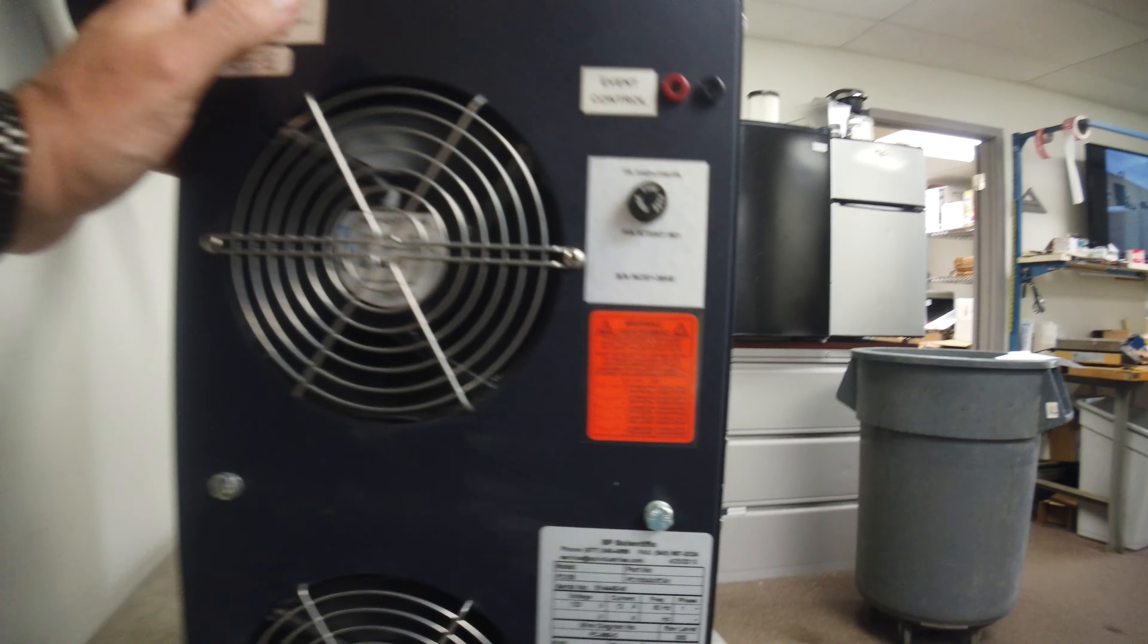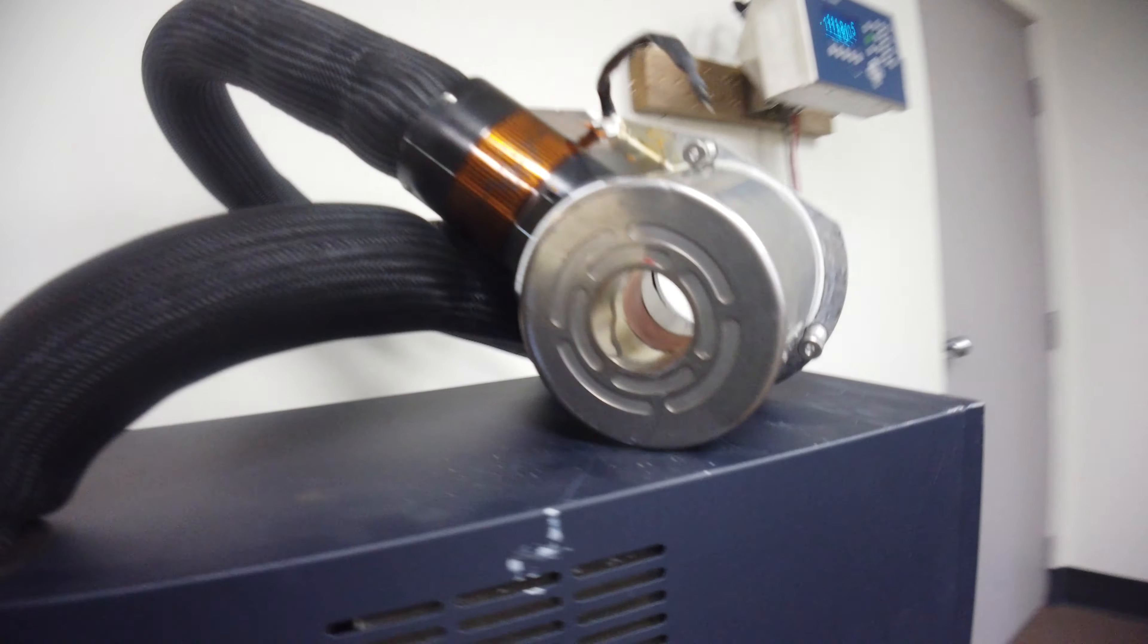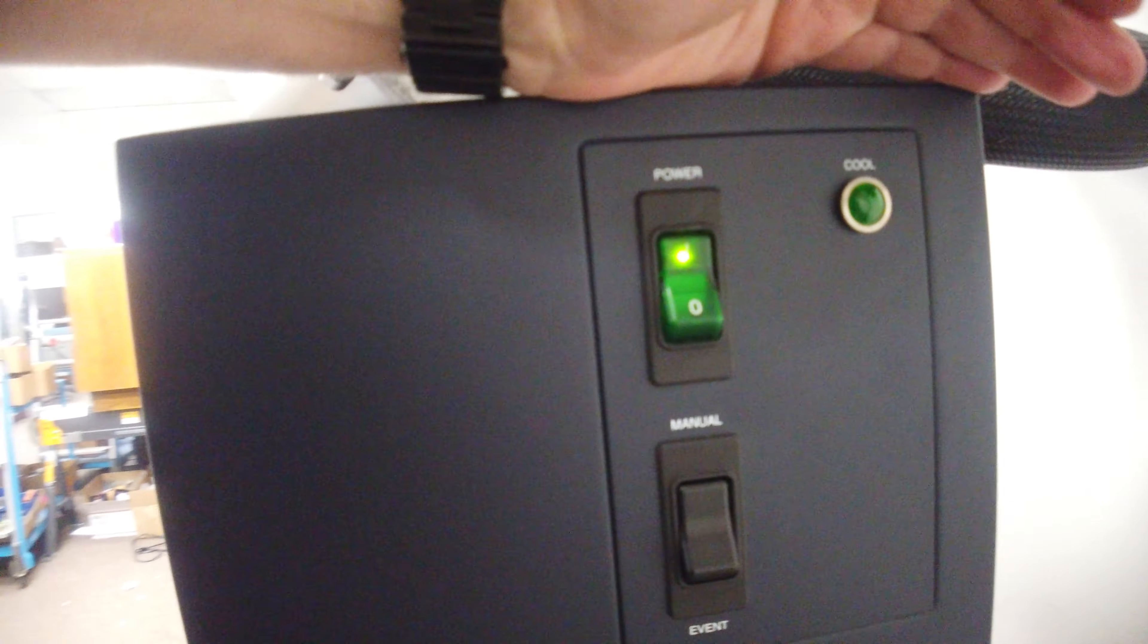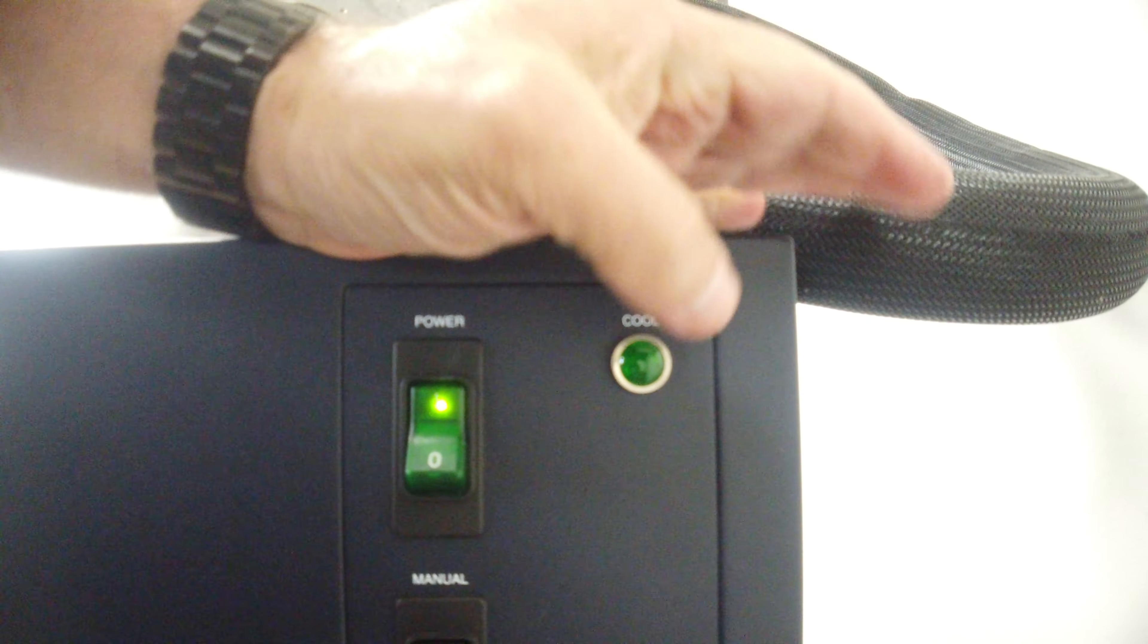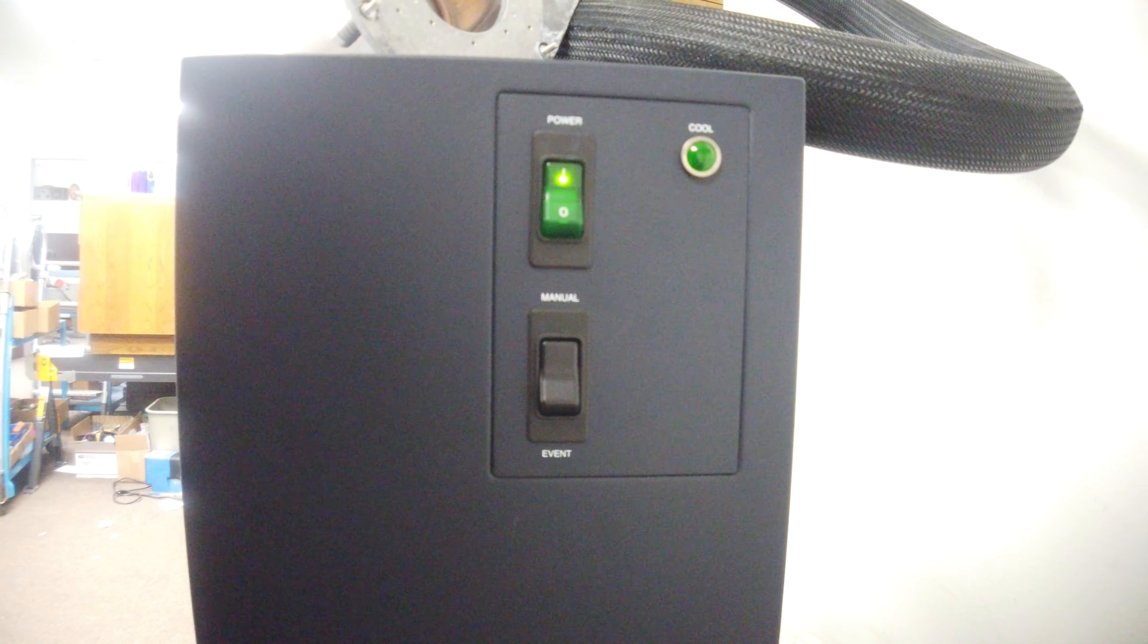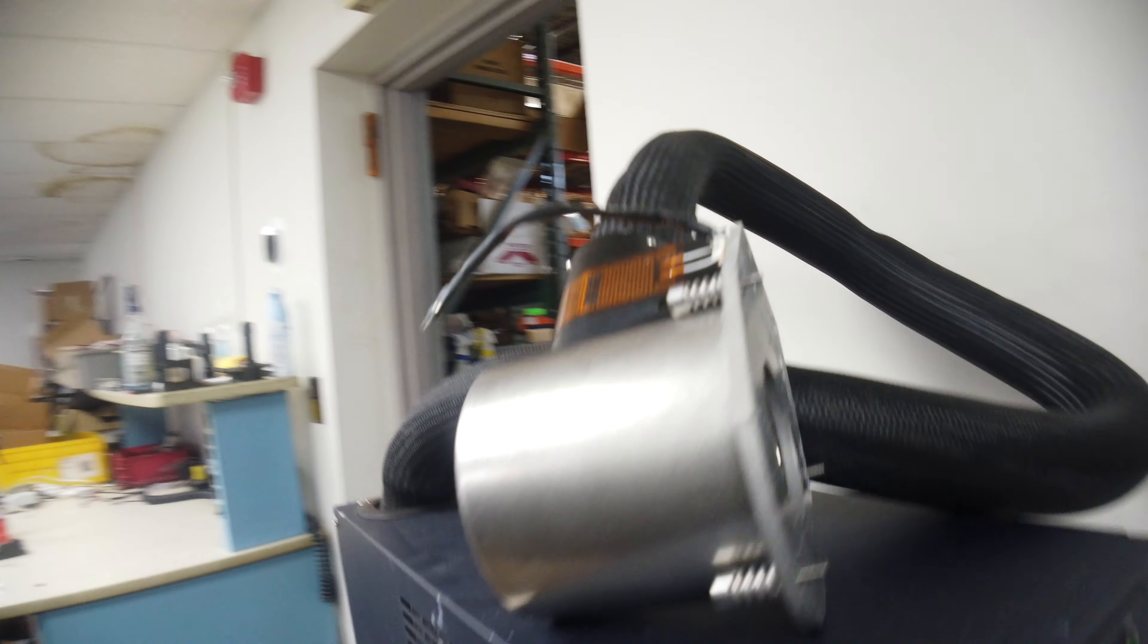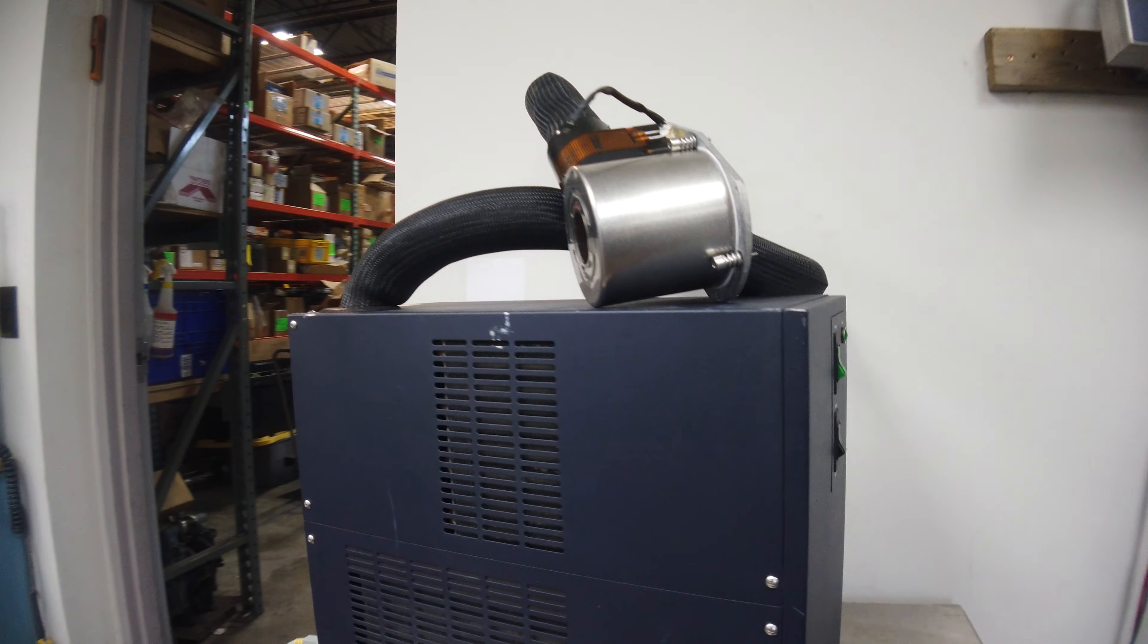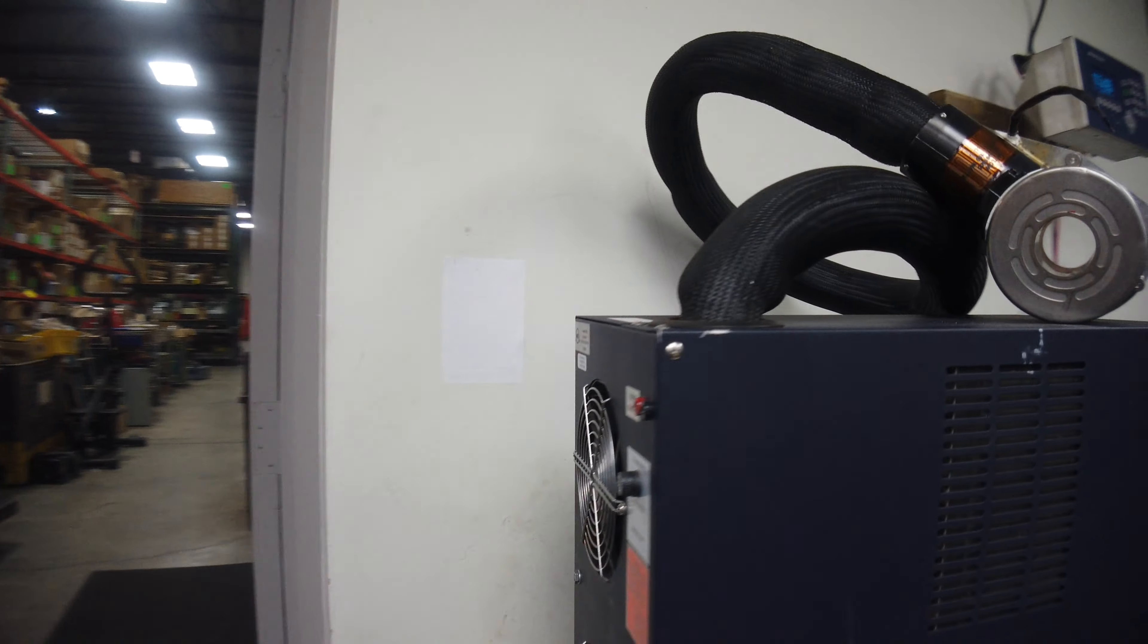Let me show you what else to show you on this. There's not much to this unit. And that's it. It came out of a lab consolidation. Seems like it's in great shape.